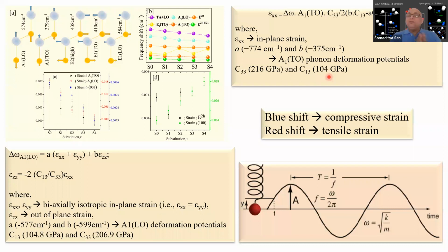So now let us go back to our original refinement, where we did the ABC, we understood the lattice parameters, and it was also a way to look into the bond lengths. So now if we study the bond lengths and see that there is a change in the bond length, we can correlate with the Raman properties. That is an excellent piece of information about what happens when we dope materials with oxides or any materials with something else.